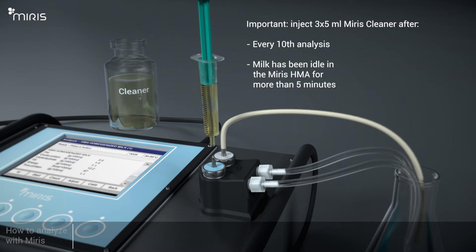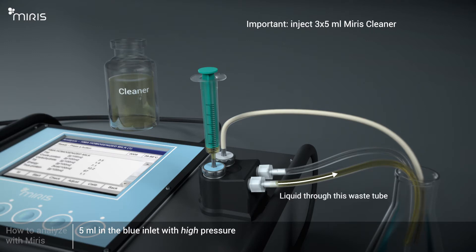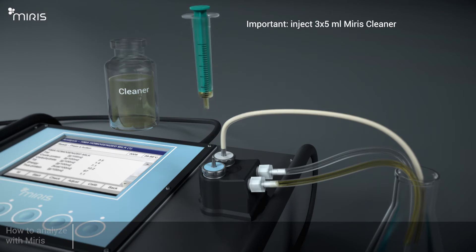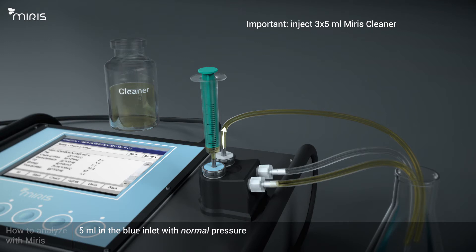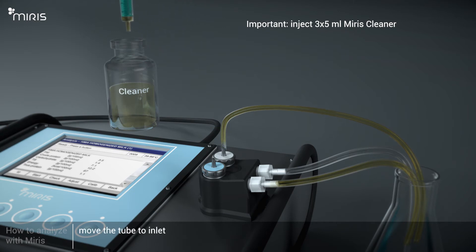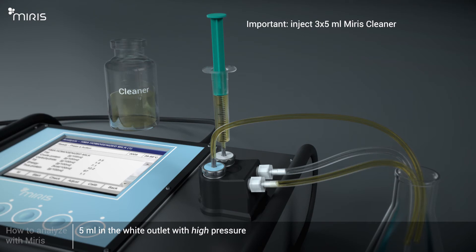Don't forget to inject 3 syringes filled with 5 millilitres of Meris Cleaner every 10th analysis, or if milk has been idle in the Meris HMA for more than 5 minutes. Inject 5 millilitres into the blue inlet with high pressure, then inject 5 millilitres into the blue inlet with normal pressure. Move the tube to the inlet and inject 5 millilitres into the outlet with high pressure.